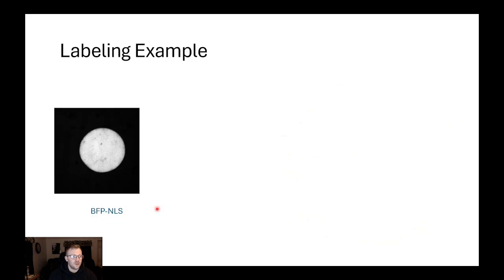So I want to leave you with one last example of how we can actually generate some real data based on experiments I did. So I showed you in the first PowerPoint, the first talk, the NLS import assay and how those import assays were able to tell us the dynamics of a protein. Well, here, this is the methodology I used to generate those import rates.